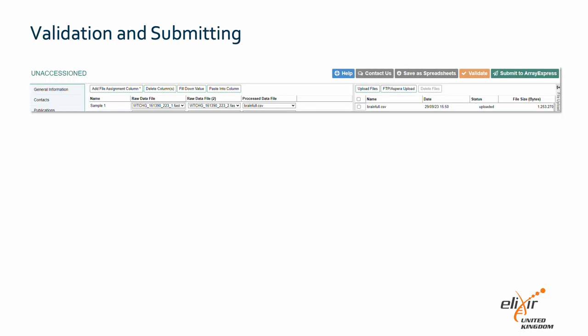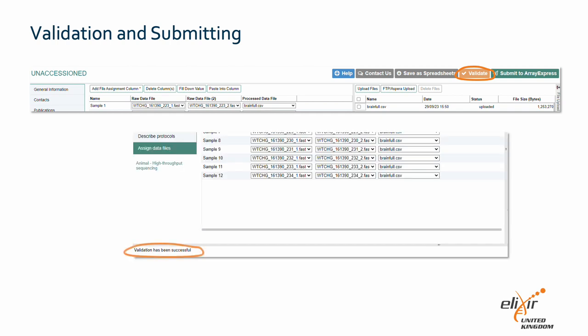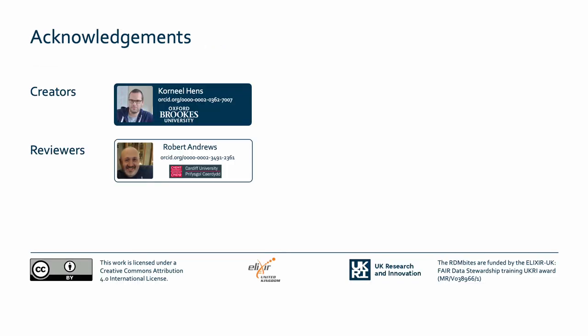You are now all set for submitting your data. First, click the 'Validate' button. This will automatically check if all fields have been properly completed. Hopefully you will get a message at the bottom of the page saying that the validation is successful. If the validation is not successful, you will find a list of problems you need to address before submission. When the validation is completed, you can now submit your data. That concludes our RDM byte on how to submit RNA-seq data to ArrayExpress.